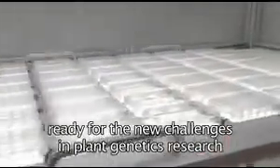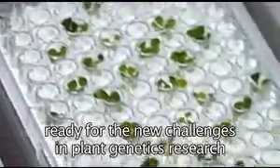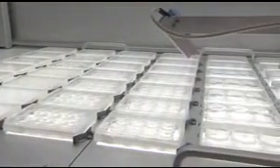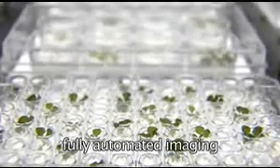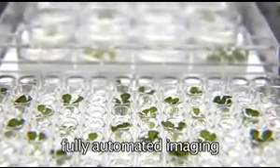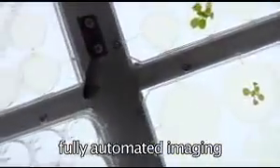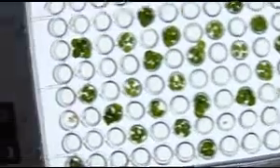The Lemnatec Scanalyzer HTS is equally able to scan adult Arabidopsis rosettes on trays and very small seedlings, insects, or other organisms in 96-well micro-titer plates. The system may image any of the following test objects: microscopic cell cultures or nematodes in water, microbiological colonies or Arabidopsis seeds, or in fact any other object up to the size of leaf rosettes with a diameter of 10 cm.